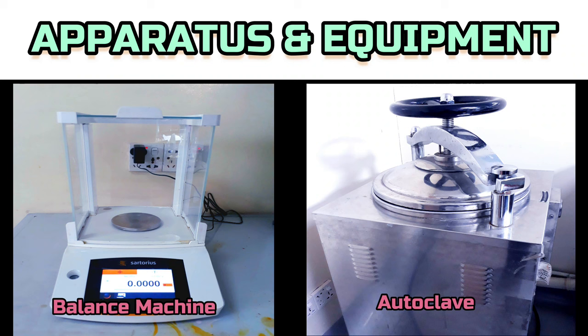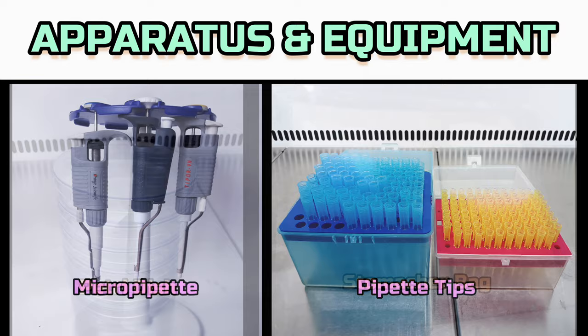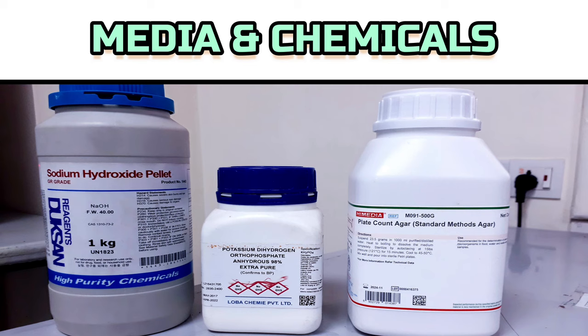To conduct this test, we need a balance machine, autoclave, biological safety cabinet, incubator, water bath, stomacher, micropipette with tips, sterile petri dish and stomacher bag, pH meter, plate count agar, potassium dihydrogen orthophosphate anhydrous and sodium hydroxide. Let's go for the analysis.